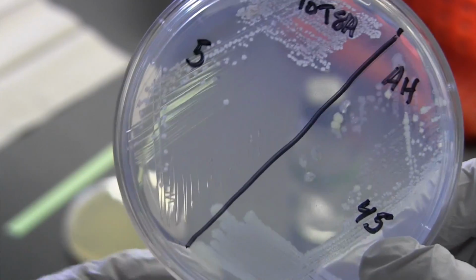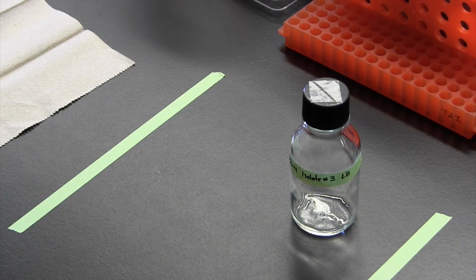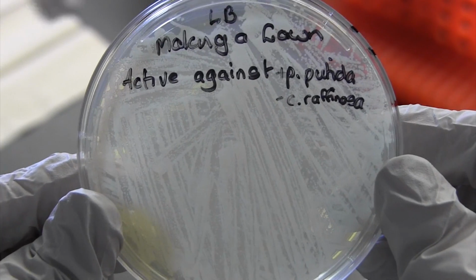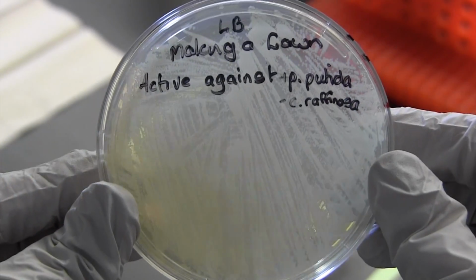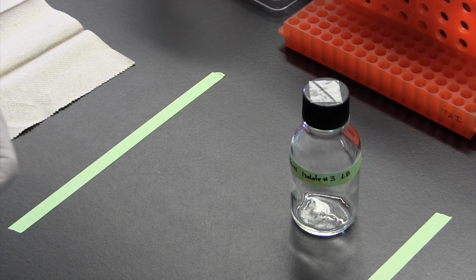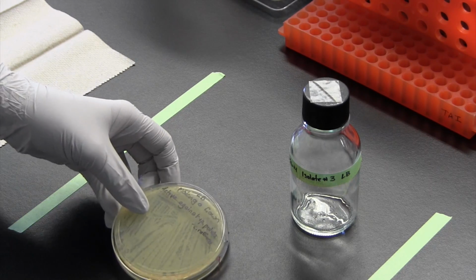But from these isolated colonies, what you're going to also do is make a nice thick lawn on LB media or whatever media it was that you have been growing your environmental isolate on. So I think in this situation, the student grew a lawn on LB media. And what we're going to actually do is use this lawn and the bacteria on it in our chemical extraction.